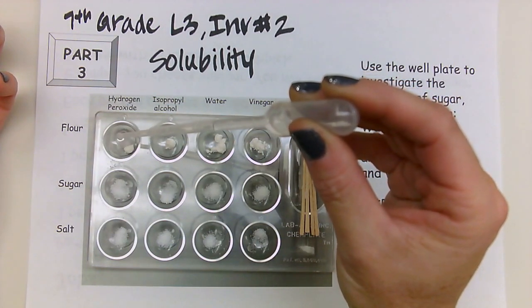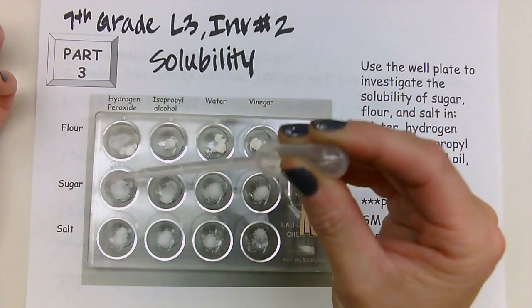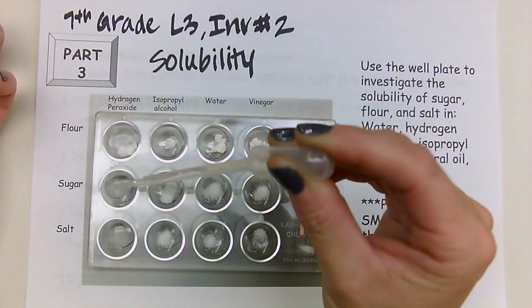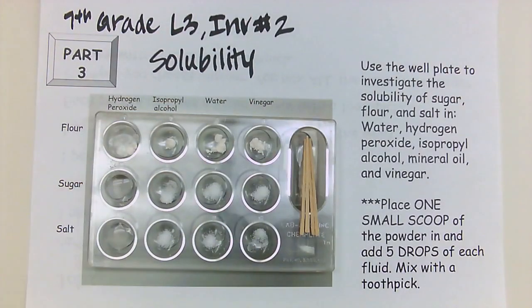1, 2, 4, 5. 1, 2, 3, 4, 5. And if you're not sure how much you put in, just make sure you have enough to mix it together, okay? So hydrogen peroxide, leave that there for a second.